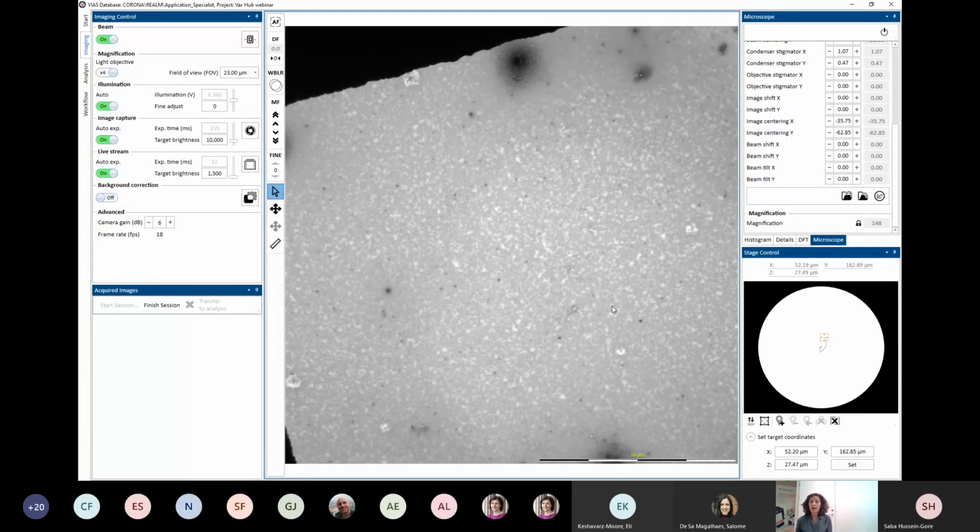A little sort of FYI is that we will have a feature incorporated into our software where we can give it an image of a grid square and we can tell it to run an analysis and then just pick out the grid squares that match the one that we have set for it, like the ones that we want. So then we can do the imaging in the grid squares that we have already predefined.